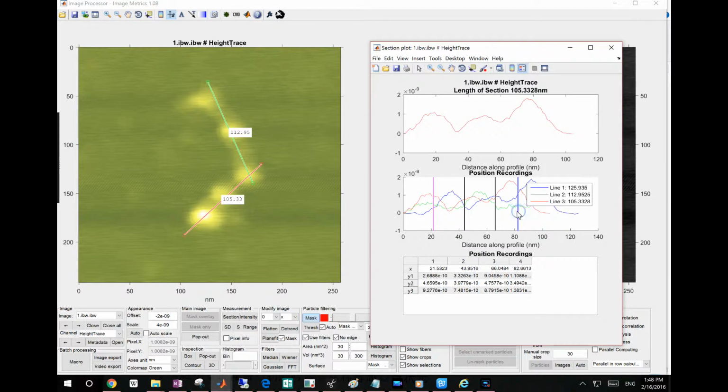When I move this blue line past this black line, now you have something interesting. You see that column 3 and column 4 swap location, and now column 3 indicates the position of the blue line, but originally column 3 was the position of the black line. So basically the column that's beneath the line will move as you move the line, regardless of whether you pass another line or not. Now we have 4 vertical position cursor lines, and I want to do some measurements.